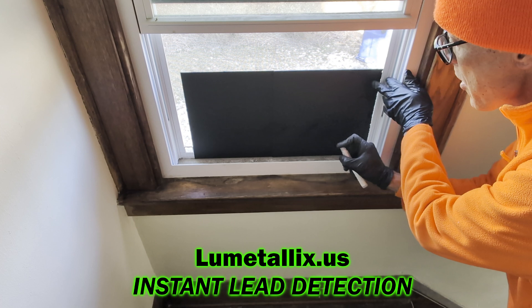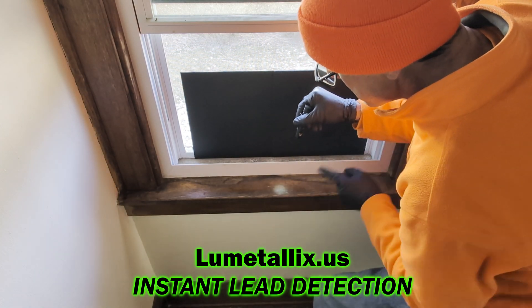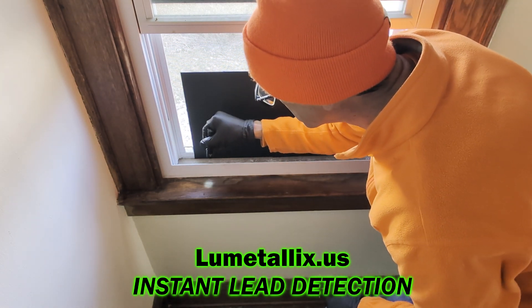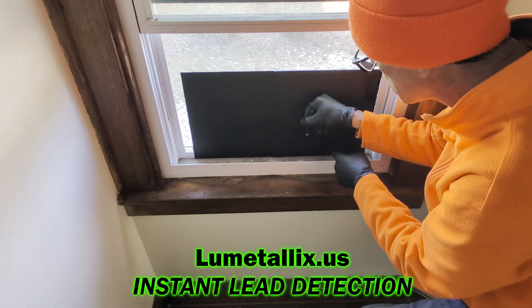Next, I use the spray and spray the window trough and the window sill. Using the UV light, I look for anything that glows bright green. If it glows green, I've found lead dust.